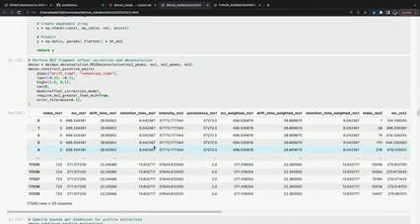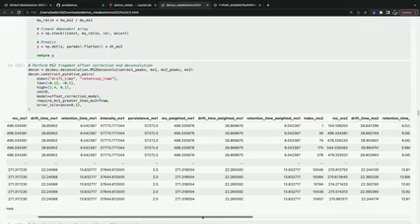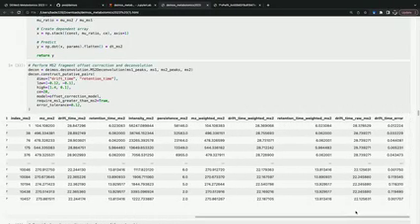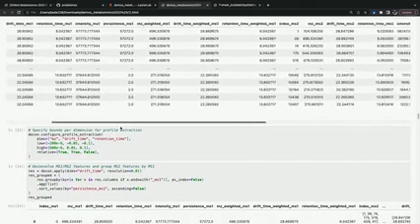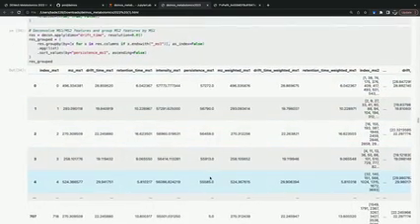And what you get as output is this table of MS1, your precursors, and then the MS2 fragments, and it contains information in every dimension. And also this column here at the end, the score. So it'll apply the offset correction model, and then you can deconvolve the MS1, MS2 features.